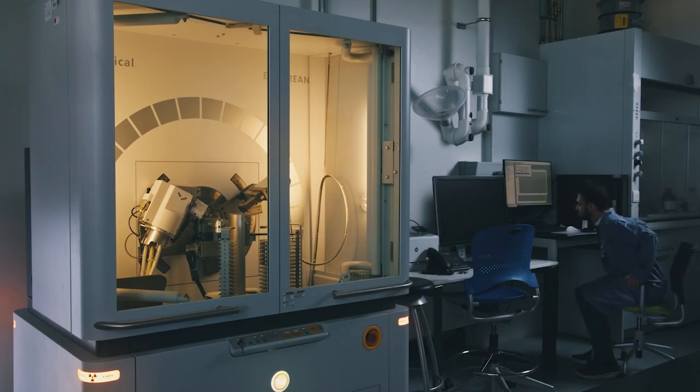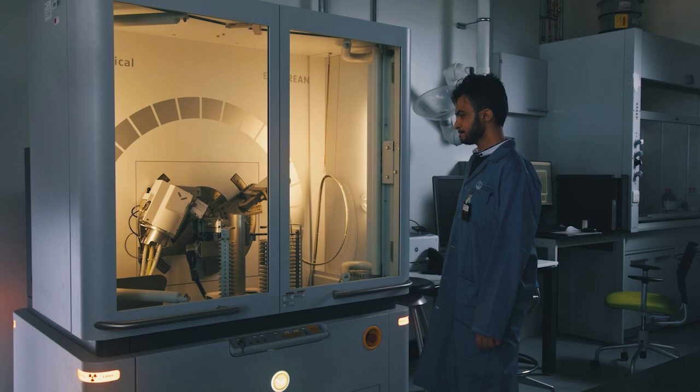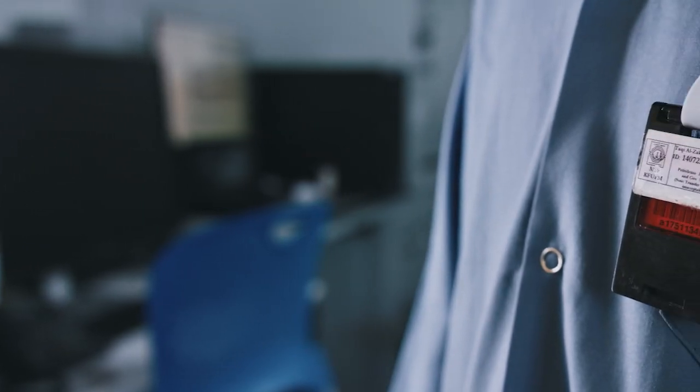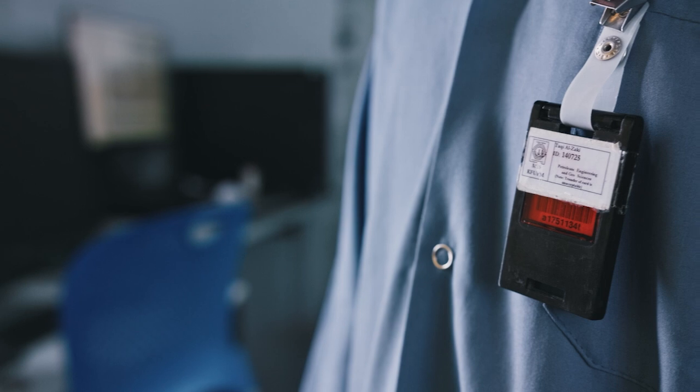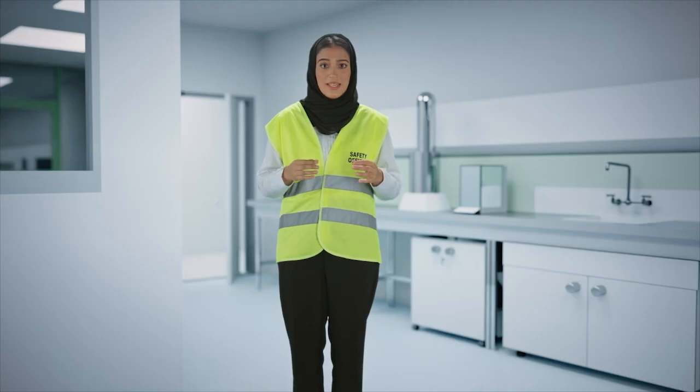For work with radiation, a personal dosimeter device must be worn. The device does not provide protection and is primarily used to estimate the radiation dose deposited in an individual wearing the device. To get a dosimeter, contact the college safety officer.